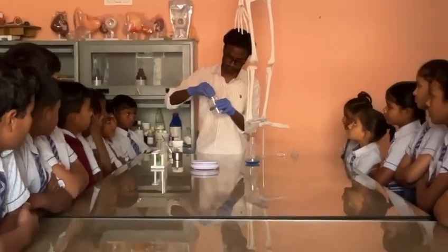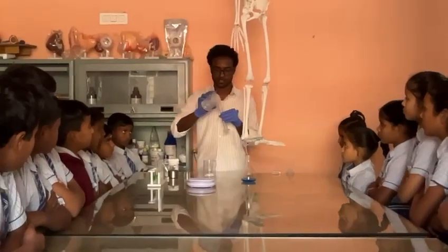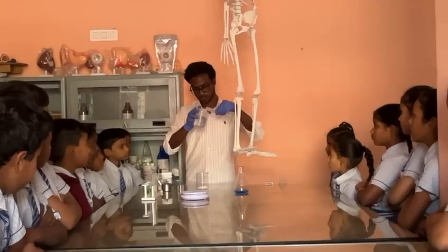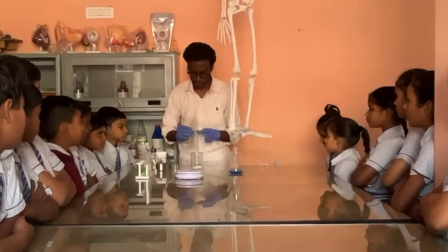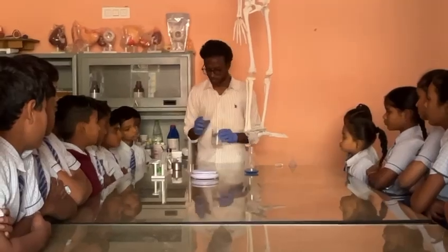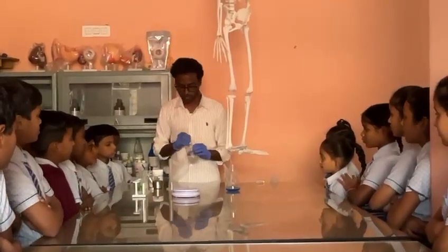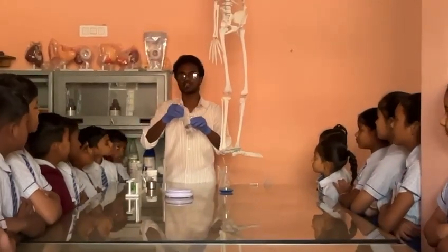Again, with the measuring cylinder, we will take 10 to 15 ml of water, 15 ml of water to dissolve this. We should use the glass rod again. Every time we are dissolving something, we should use what? Glass rod. To dissolve something, you should use a glass rod to stir it. Stirring means what am I doing now? Mixing. Nothing but stirring.